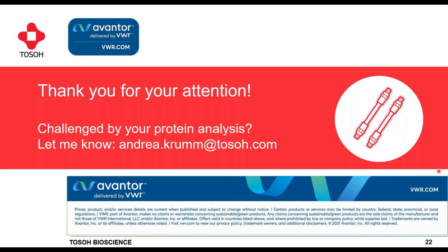Though I think there are 1 or 2 papers out there that showed you can connect both, that work with lower salt concentrations and instead used some pH shift. But it wasn't the most straightforward way of working, I would say.